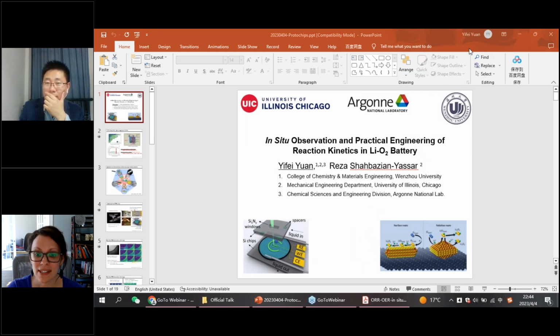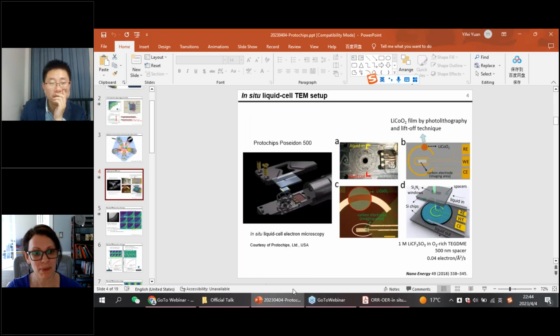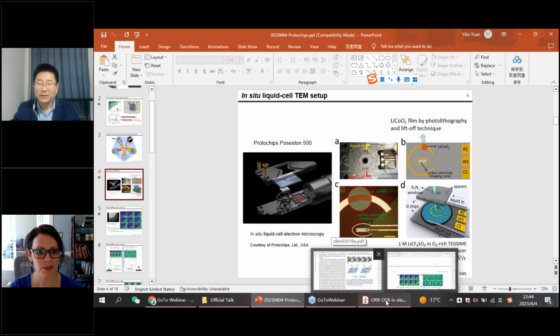We actually have several questions surrounding the chip preparation for the batteries. A lot of people are curious if you can explain in more detail the deposition method for the lithium cobalt oxide onto the counter electrode. They want to hear a little bit more about how you deposited it, how you knew how much to deposit. I think there's a lot of people interested in customizing the counter electrode material. So if you could talk more about that process.